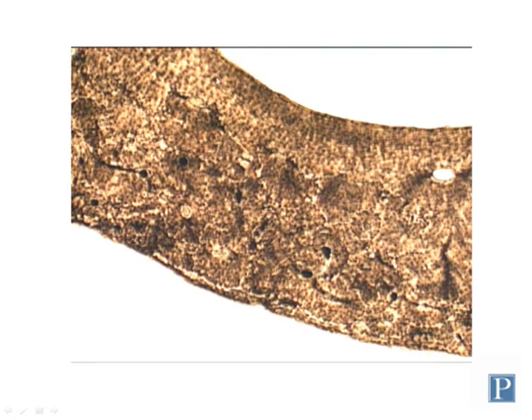And these lamellae here, instead of being part of an osteon with a relatively small diameter, traverse the entire width of the bone here on the inner circumference. So these are called the inner circumferential lamellae. These lamellae here on the outside are even longer or larger in diameter, and they span the entire external circumference of the bone, and so they're called outer circumferential lamellae.